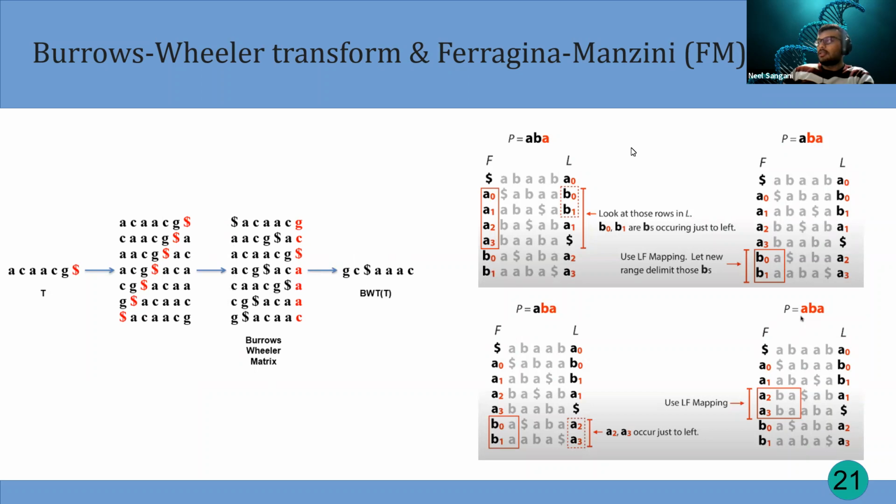Alongside this, it uses the FM index to map the reads, to find these specific reads found in the given data set on the genome.